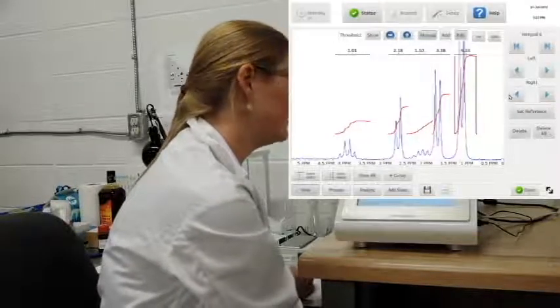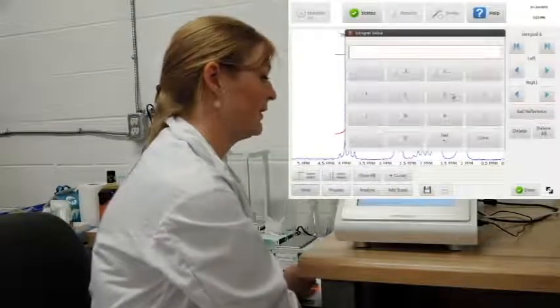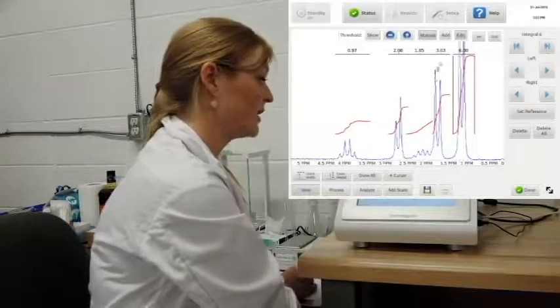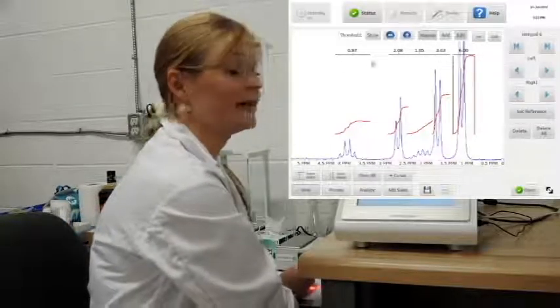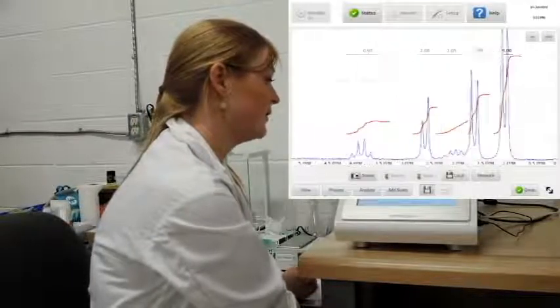So I'm going to pull in my tail here, extend this tail, and again, this is 2 methyl groups, so I'm going to integrate them to 6. So they integrate 6 to 3 to the next methyl group, approximately 1 for both of the methynes, and 2 for the methylene. Okay, so I'm going to save this locally as well.